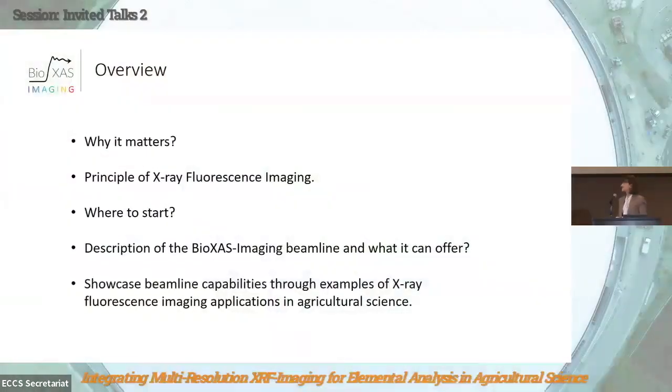Please. Thank you for the lovely introduction. So this is the short overview of my presentation. Why synchrotron techniques matter, and what type of insight they can offer in agricultural science. I will also touch upon the principle of X-ray fluorescence imaging for potentially new users, and what factors to take into consideration when selecting a beamline of interest.